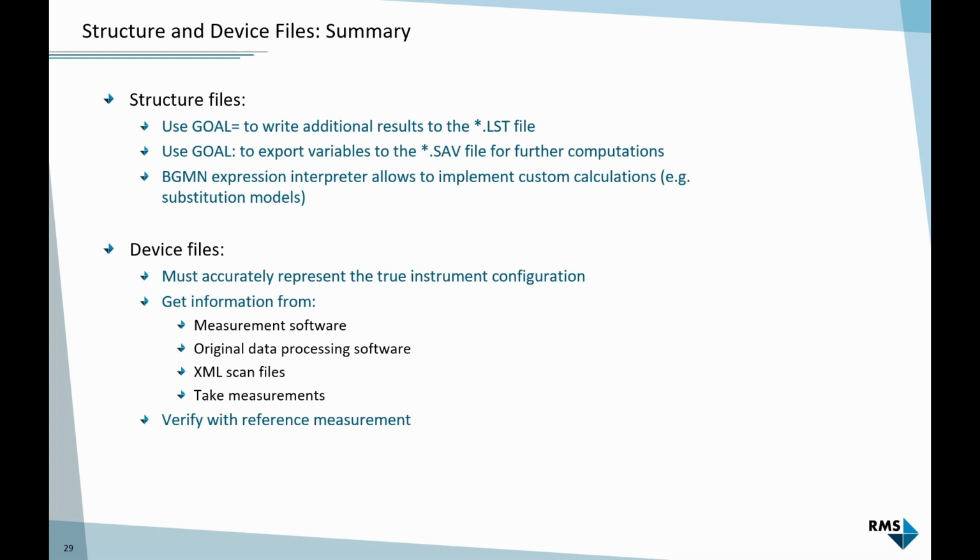I prepared a sample with a strong texture. I will show you how we can refine this. Another sample contains anisotropic crystallites, so it's a precipitated apatite with needle-shaped nanocrystalline crystals, and I will show you how to refine this. It takes some special measures to fit it well.